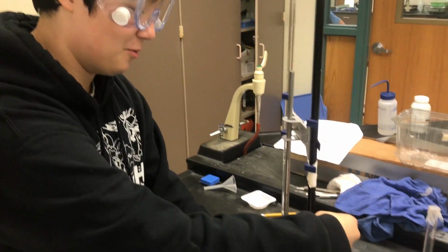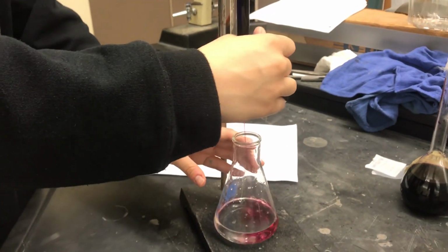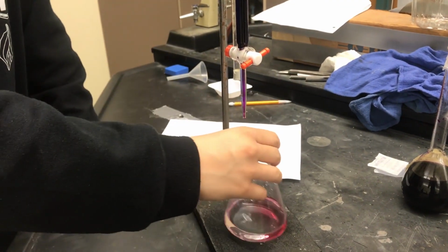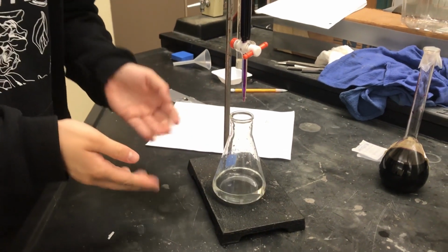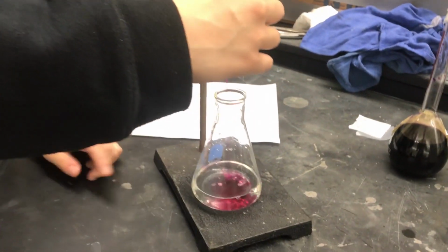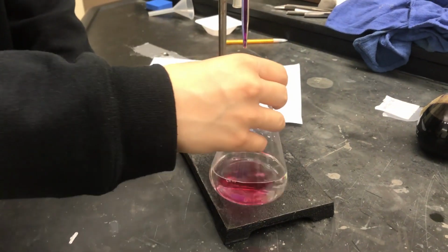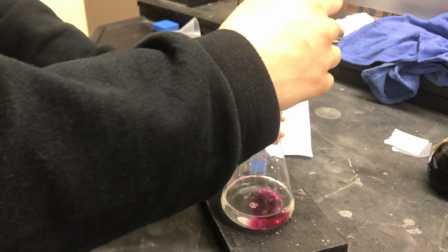Now, when you're titrating, you open the stopcock, and every so often you stop and swirl it around, and you'll see that the solution becomes clear again. As you get closer and closer to the equivalence point, the pink will not dissolve as quickly, and that's when you want to start slowing down.